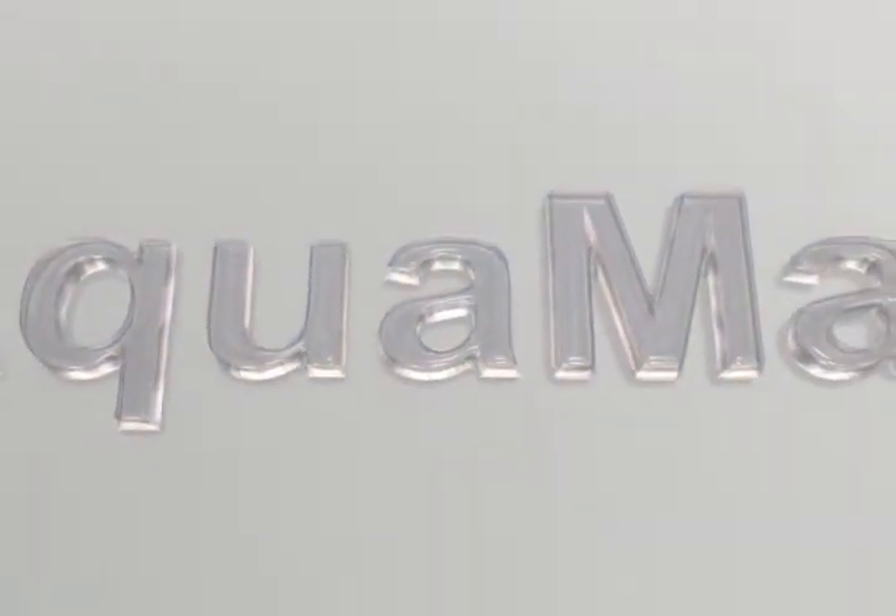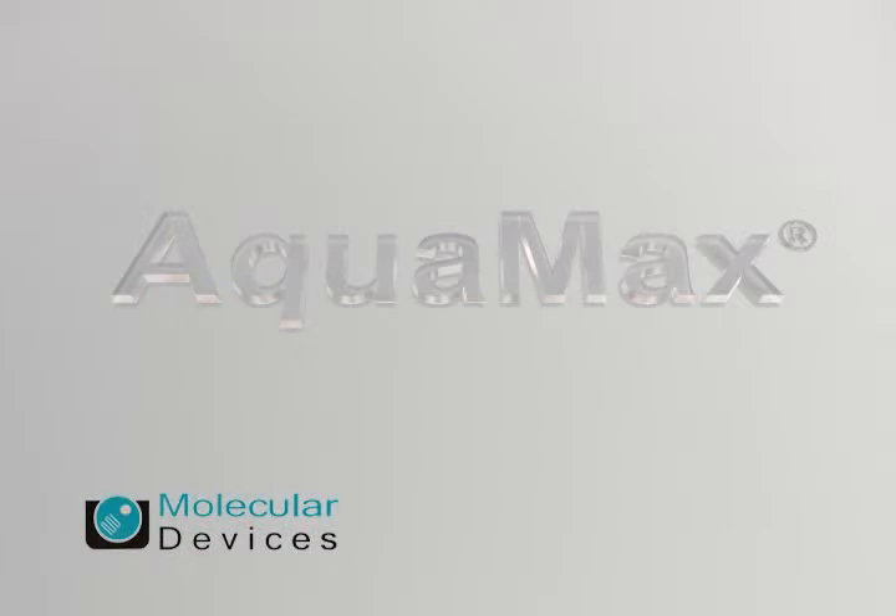The modular design and built-in performance enhancement utilities, such as self-clean, standby, and shutdown modes, improve the robustness and reliability of the new generation AquaMax 2000 and 4000 series microplate washers.